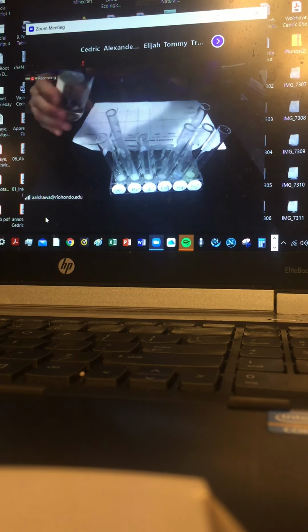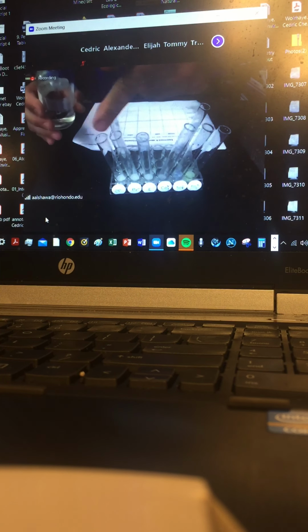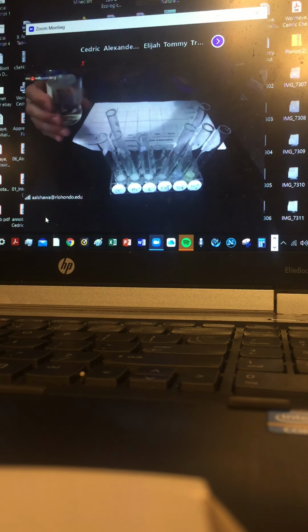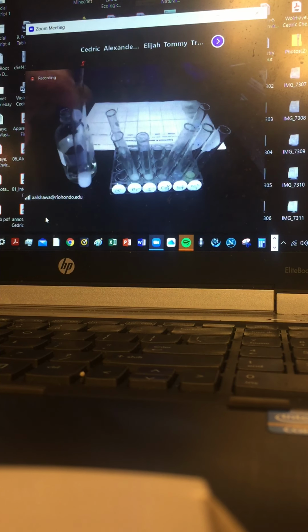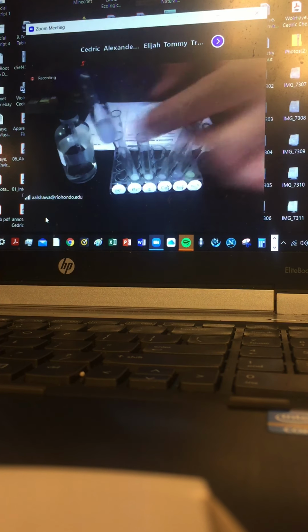So instead of just a few drops, I want to add a few drops of the 6 molar nitric acid across. Whatever amount of material I added, which was 1 milliliter, I need to add a replica of nitric acid. So here's the nitric acid. Okay, nitric acid didn't do much.